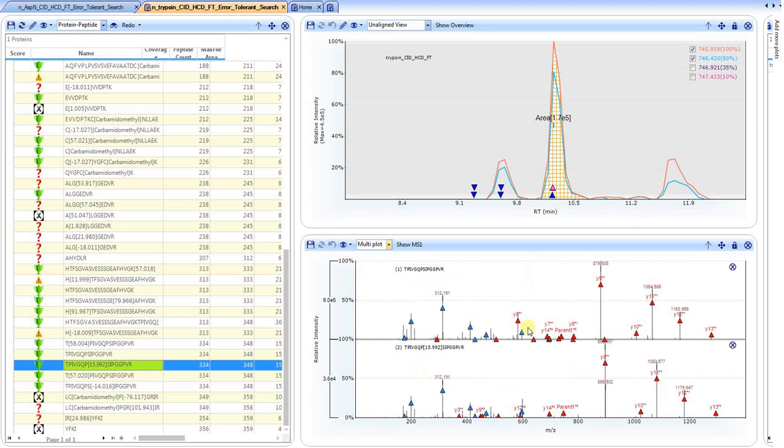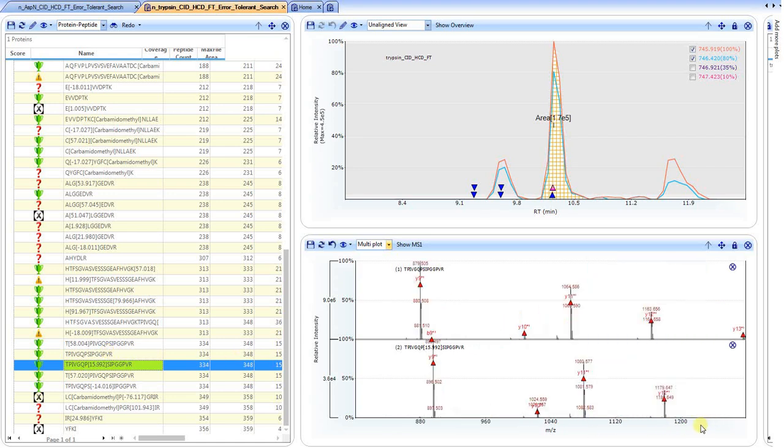If we zoom back out, we also see the red. And the red represents those fragment ions that are attributed to the sequence, but have a different mass-to-charge value. And if we look at the high mass Y series, we see that the Y9, Y10, Y11, and Y12 are all offset by roughly 16 Daltons. And again, we utilize the difference to try and localize the site of the modification. This ends the video for the error-tolerant search.